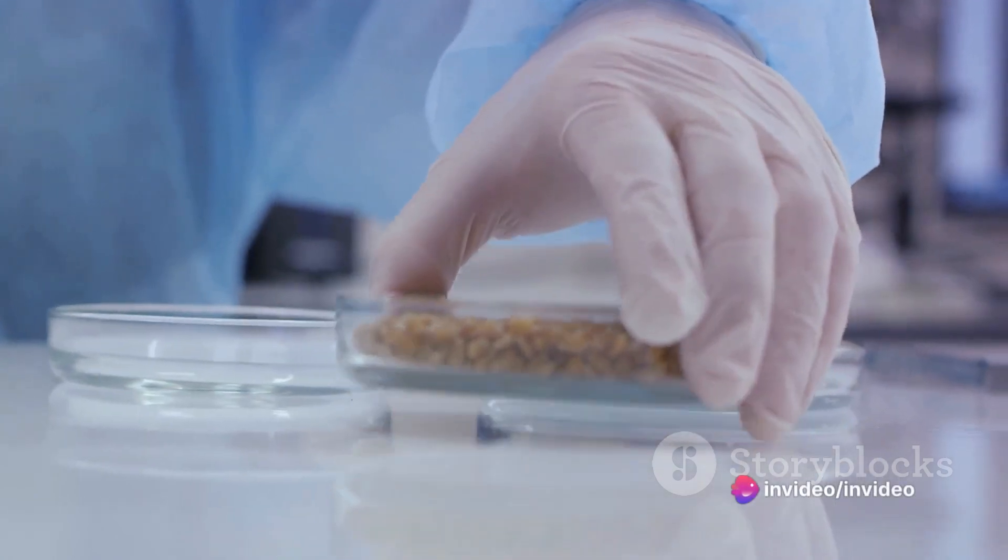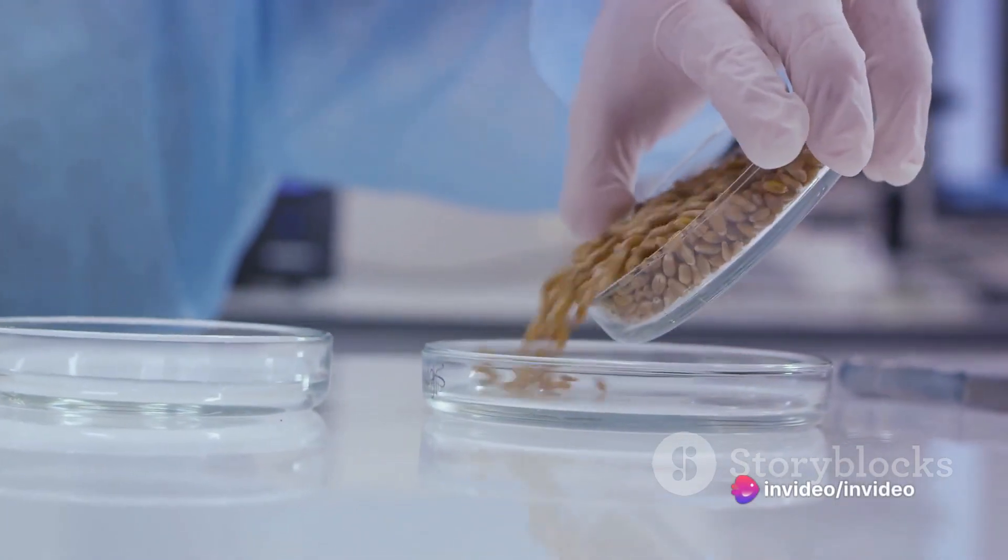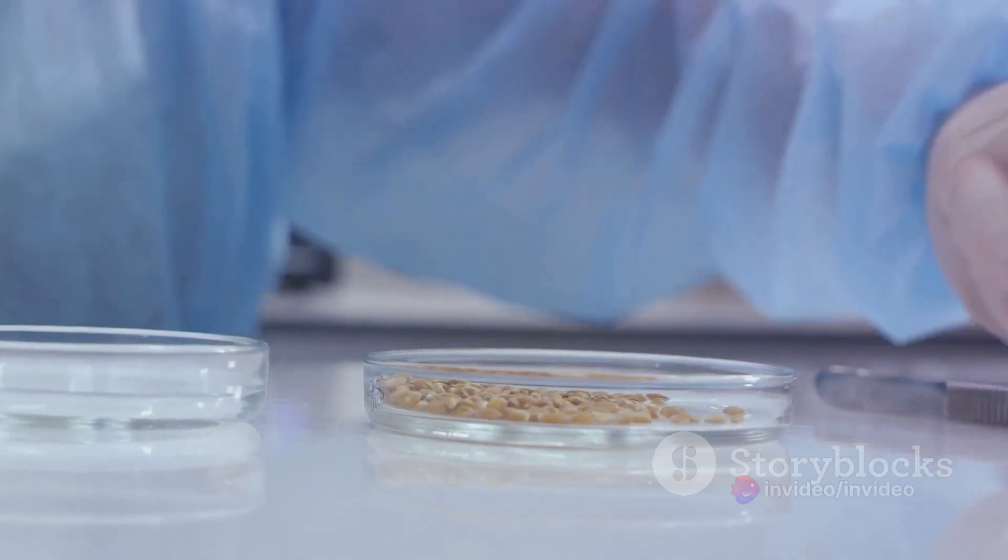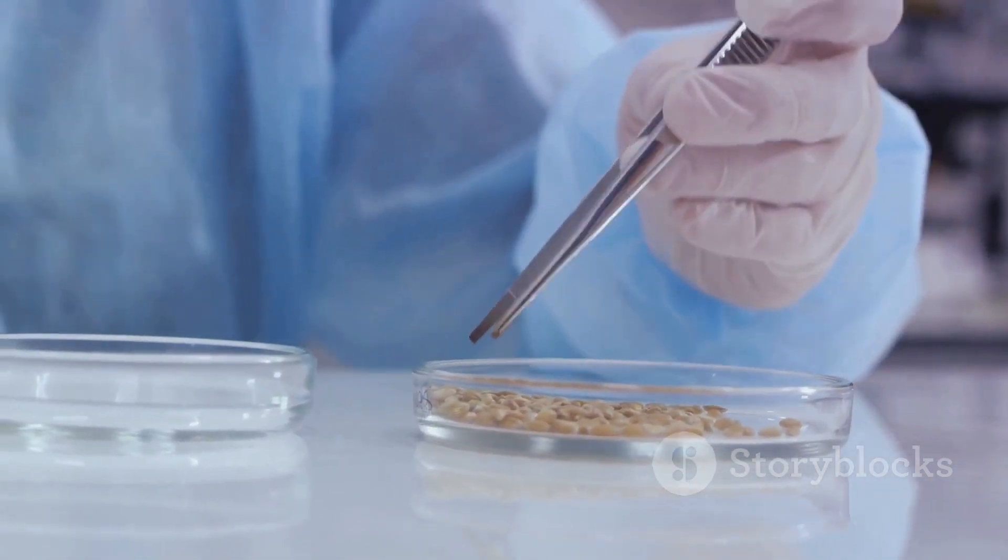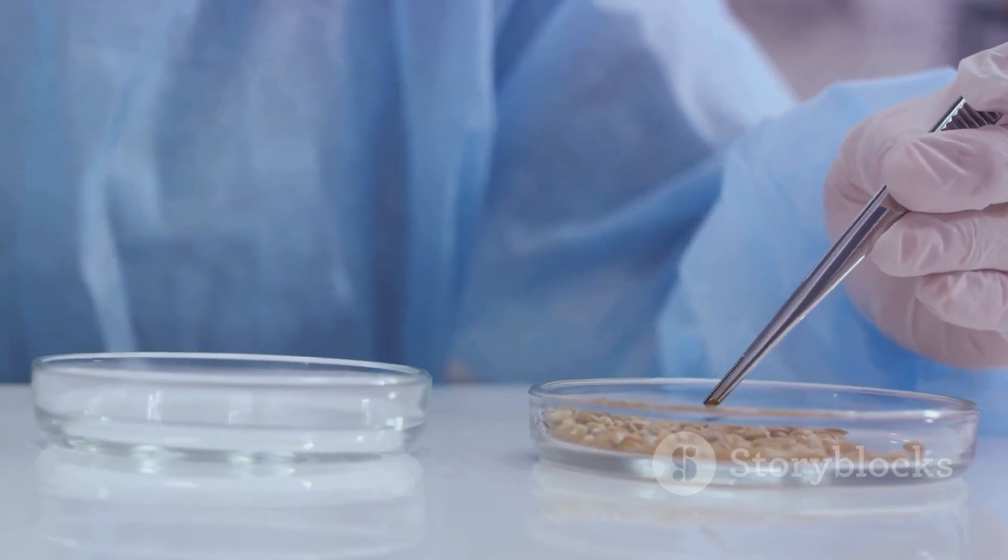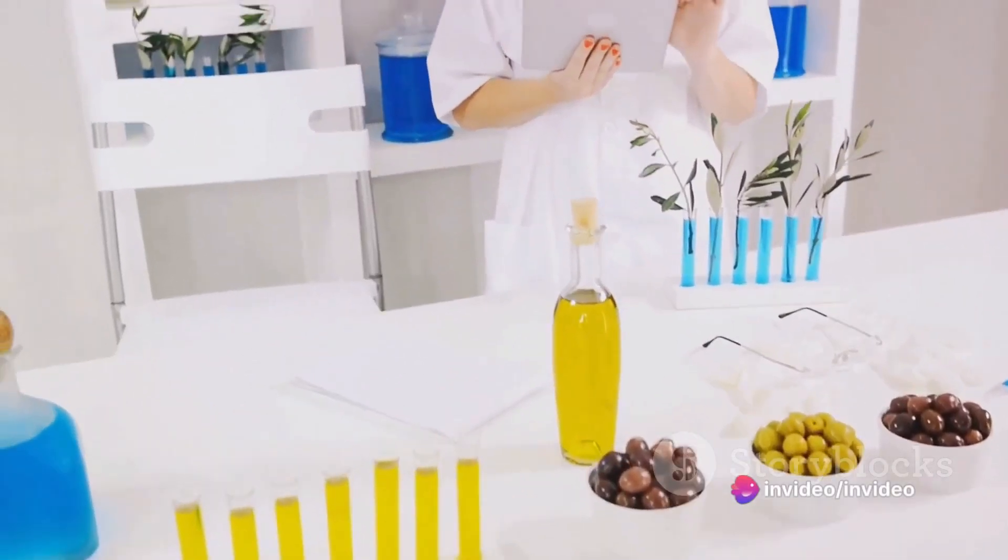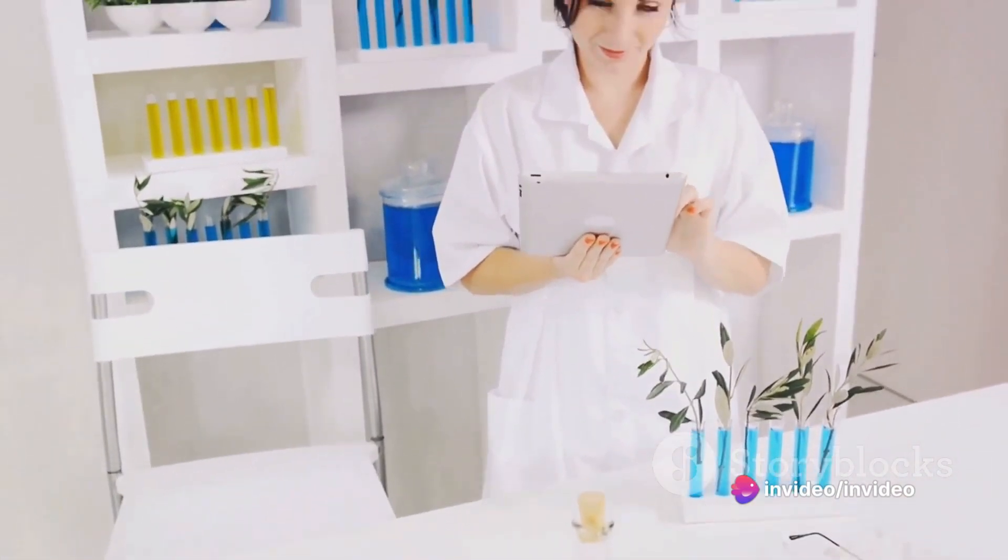The process begins with the separation of water from the food sample. This is done through a process known as drying. The sample is subjected to a certain temperature for a specific period, causing the water to evaporate. The difference in weight before and after drying gives us the moisture content.